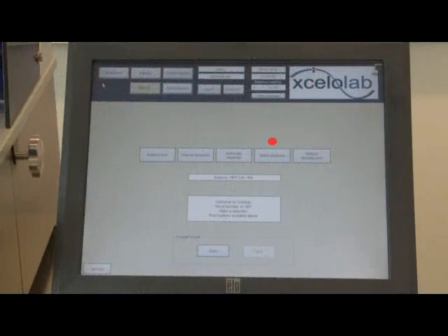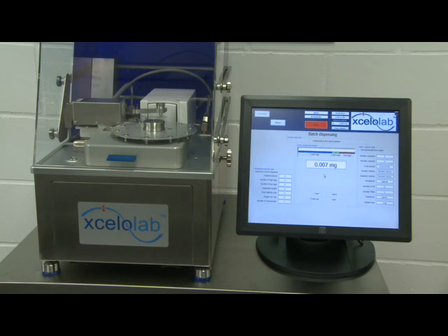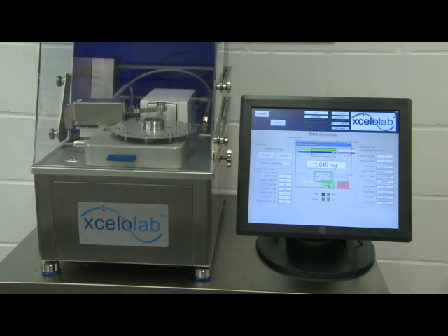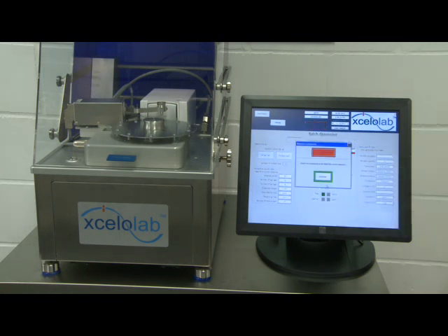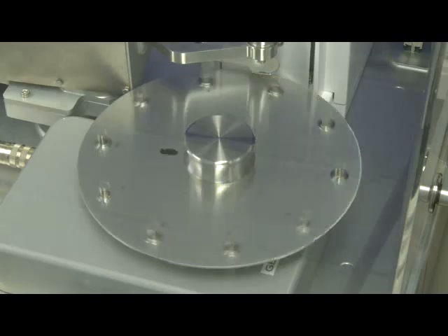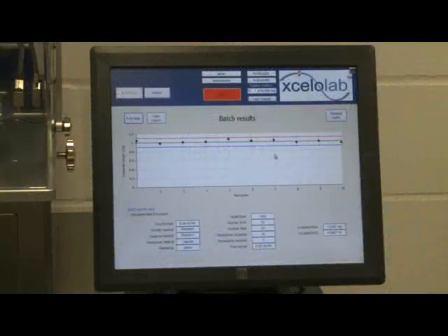In batch dispense mode, the carousel option is used to facilitate batch filling. The Accelerlab dispenser can perform batches of up to 100 dispenses at identical target weights. The batch function performs repeat automatic dispenses into multiple receptacles using the same dispense, powder and receptacle methods for each dispense. The dispense is performed automatically and the operator manually initiates the next dispense. The dial plate rotates automatically and the operator continues to initiate each dispense until the batch is complete, at which point the HMI displays a scatter graph of the batch results and data specific to the batch. This data can be printed or viewed as a report.